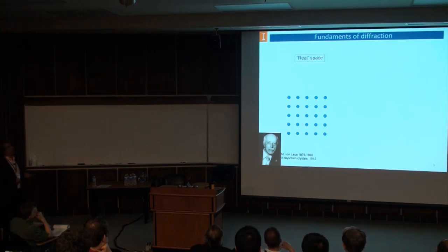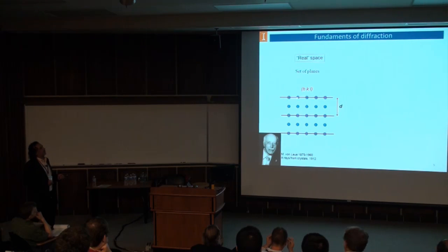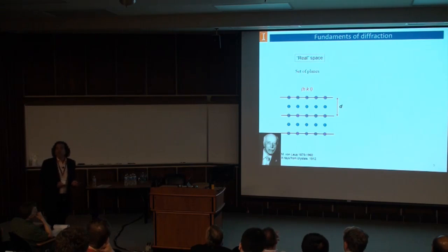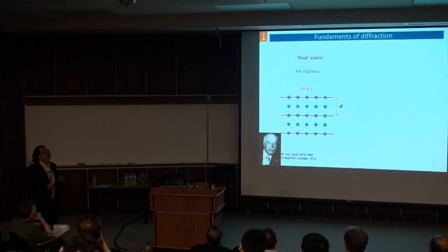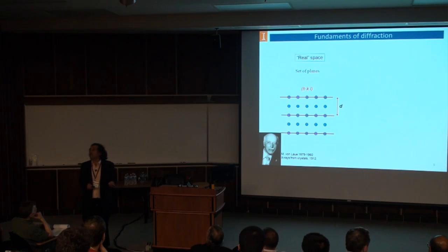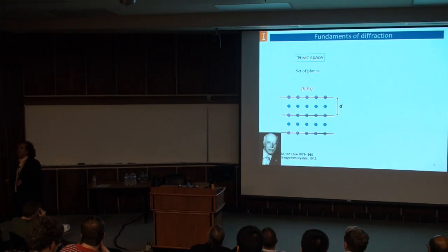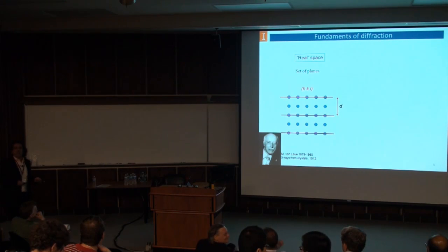So the first thing you do is that we work with imaginary planes. Say, for example, you have these planes marked in this picture with the Miller index HKL. Unfortunately, the X-ray diffraction technique does not show a real world image of the material. It goes into this kind of twilight zone, weird kind of world, which is not really the direct world, it's the reciprocal space. The reciprocal space can be very intimidating in the beginning, but it's pretty easy once you get your way around. So let's go with me inside that twilight zone world and try to walk around and understand what we see.